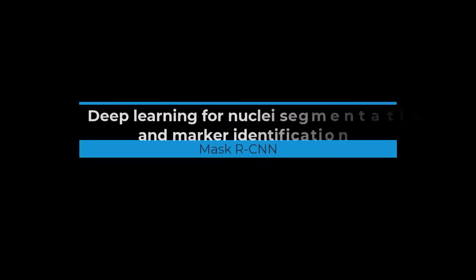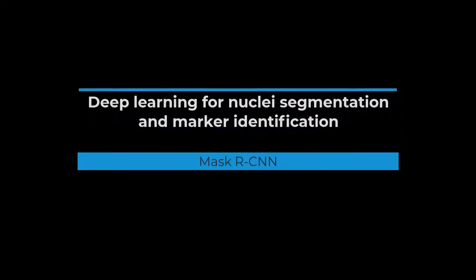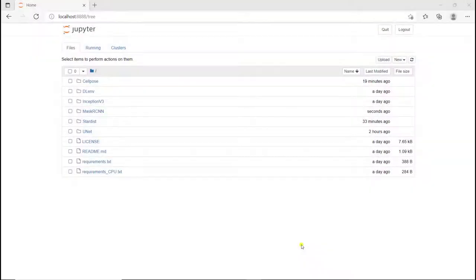In this video I'm going to show you how you can train the Mask R-CNN model and then use it to segment nuclei.